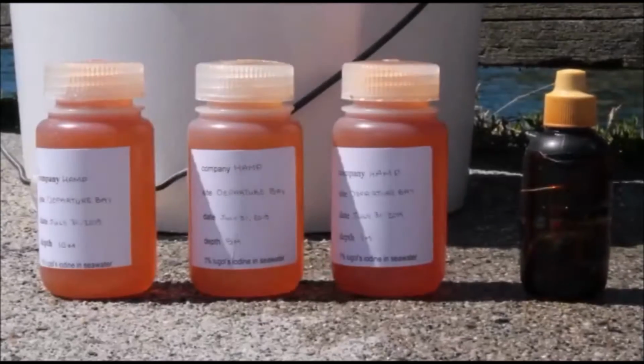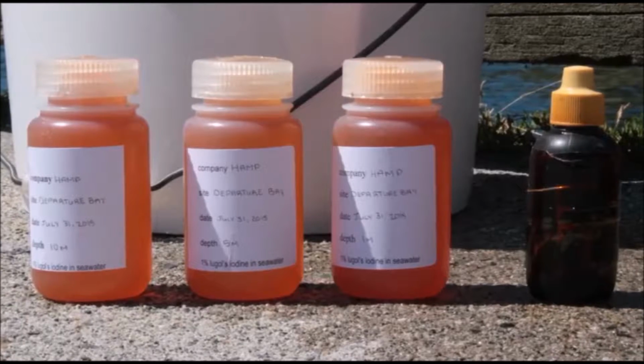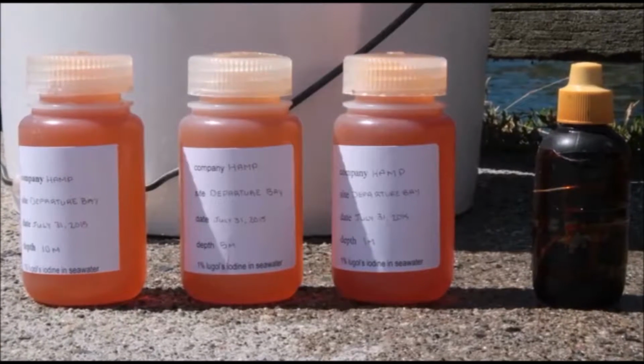There we have our 1, 5, and 10 meter samples. Those are the HAMP sampling depths. Nicely preserved, beautiful color.